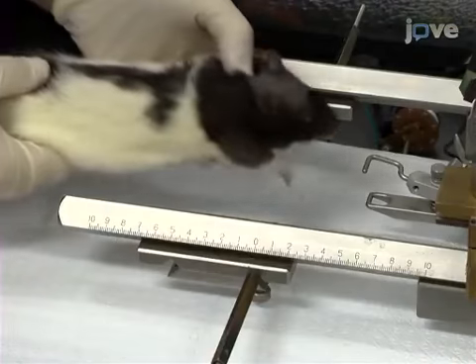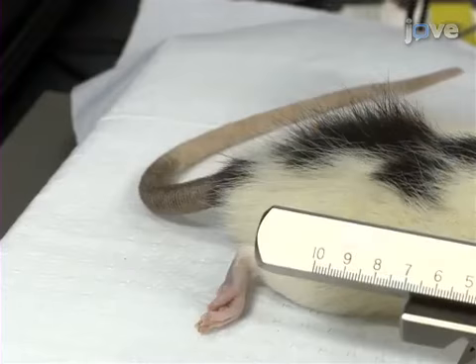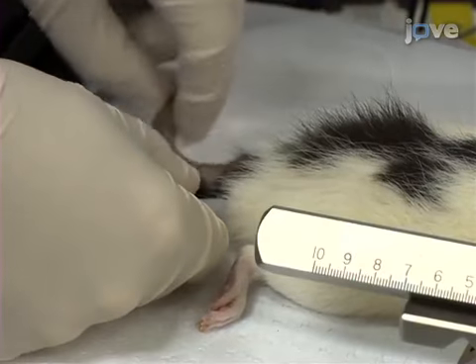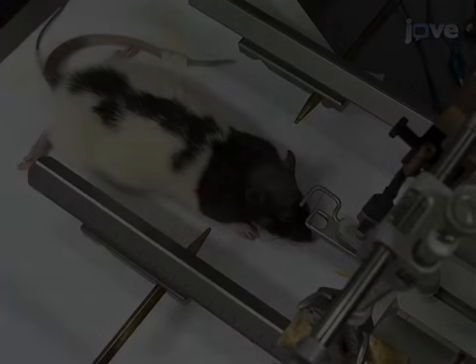Place the rat in the prone position on a homeothermic plate, then insert a rectal probe to maintain the homeothermic plate at 37.5 degrees Celsius.